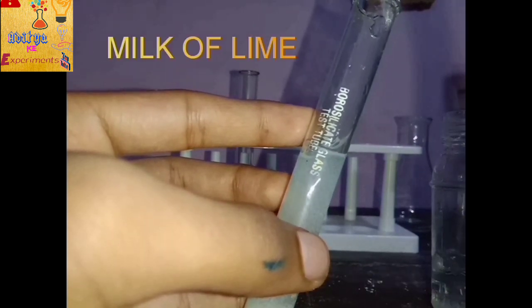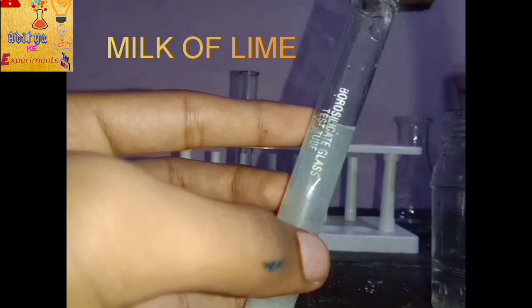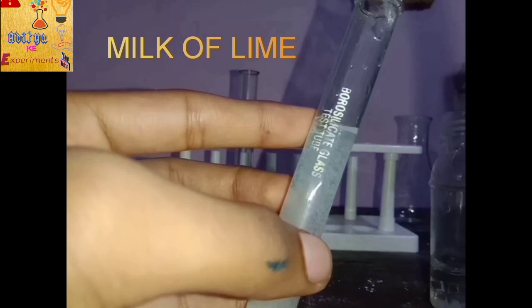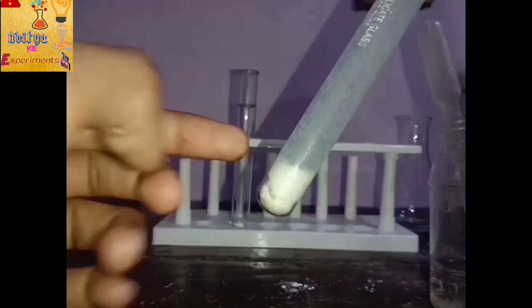Do you know what? Calcium hydroxide is also called milk of lime. Its another name is milk of lime. Now as you can see, it's insoluble in water, so it's not mixing properly, but we will try to mix it. Now I think the solution of calcium hydroxide is ready to work.